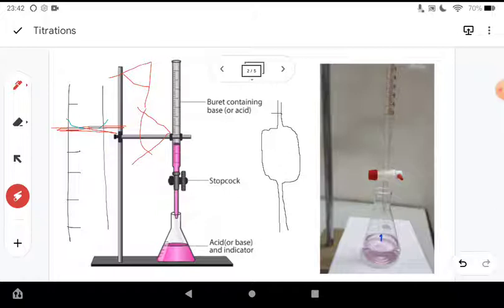The next time I do that, I take this volume of solution that was used. I can fill this up to the top again, or I can leave it there as long as I've got enough still in the burette. I open the tap up. I need to empty this out and replace it with the same volume of the same solution again.